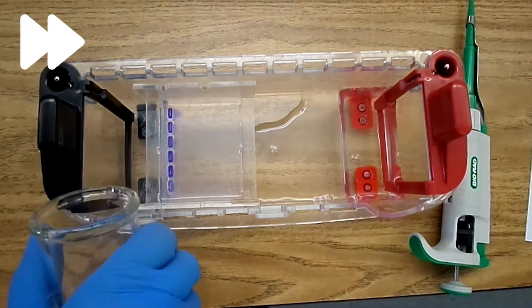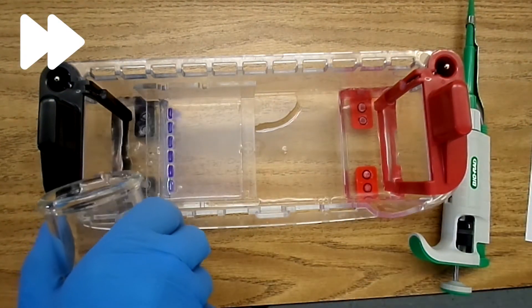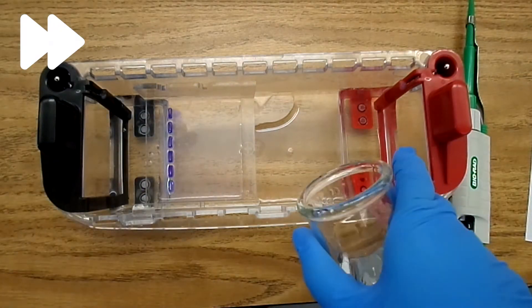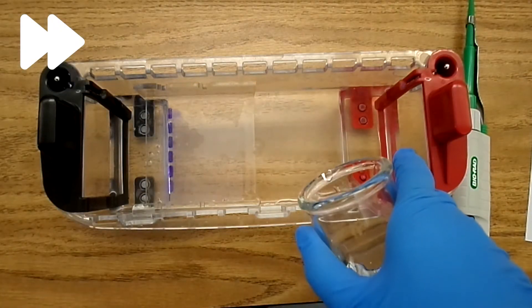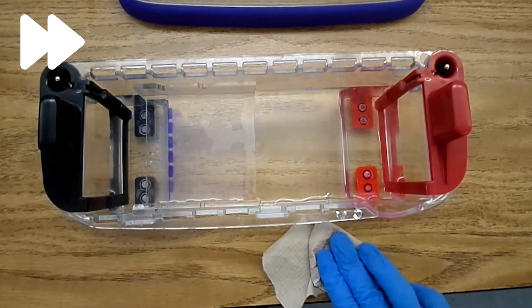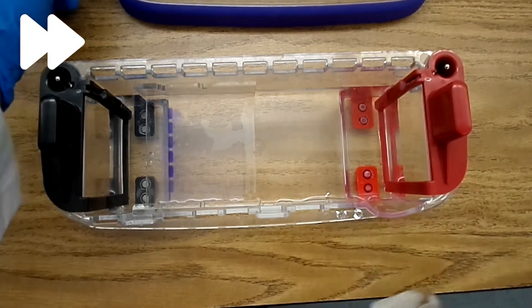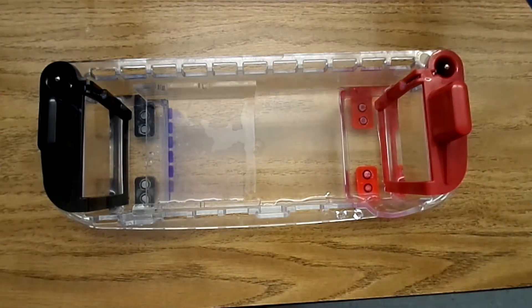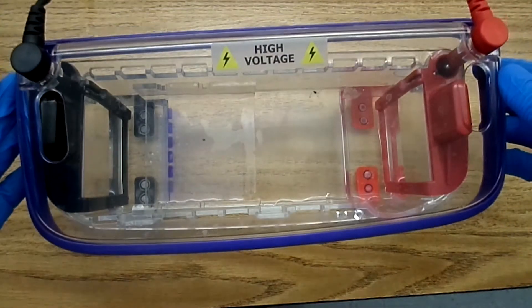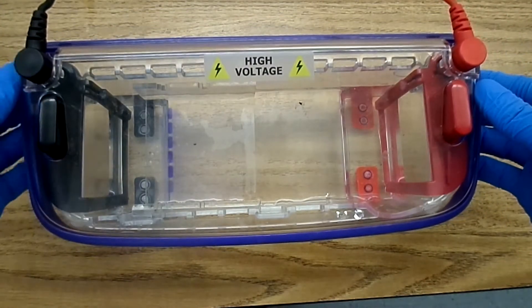Next, we're going to carefully pour in our buffer solution until it just covers the top of the gel. First I'm going to clean up any extra buffer that spilled, and then I will place the top of the gel electrophoresis chamber on so we can start the power.